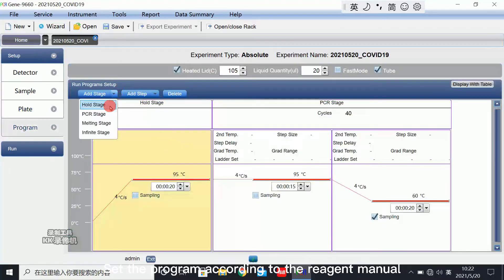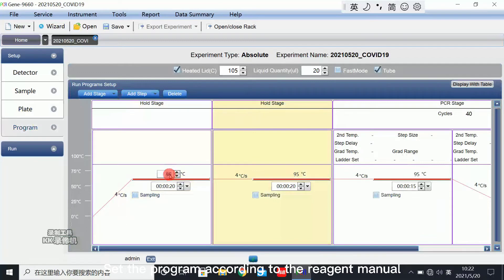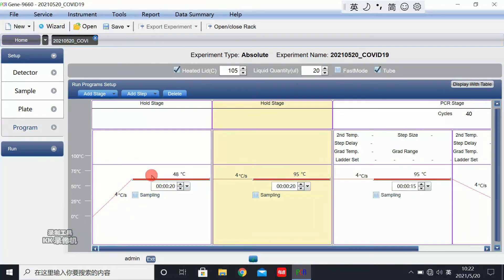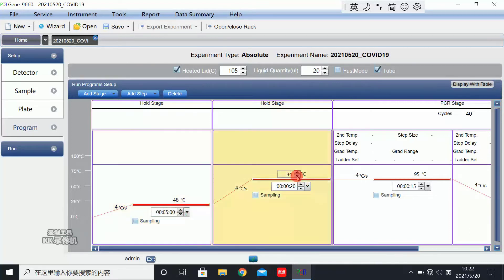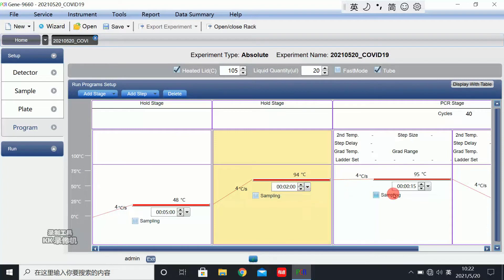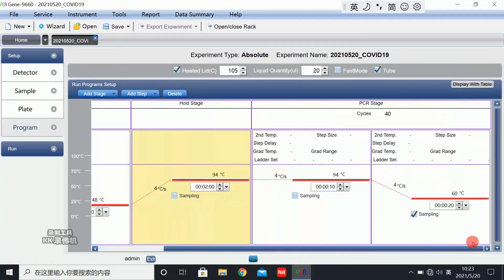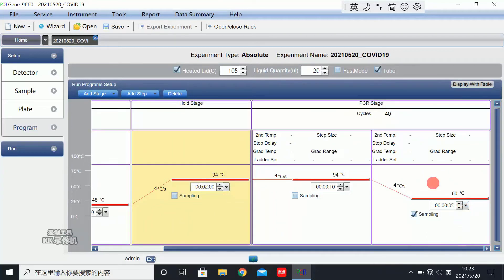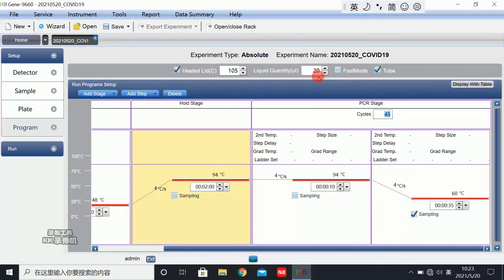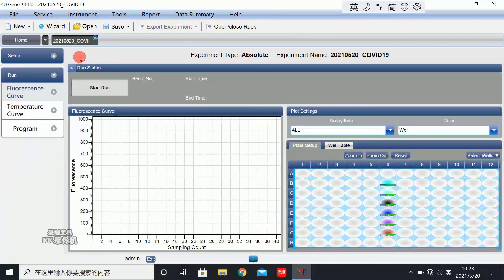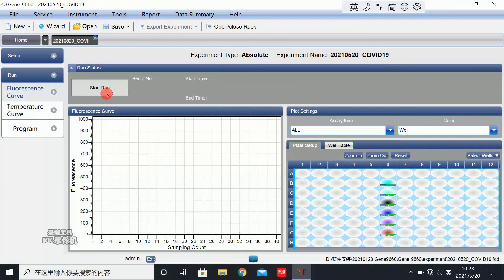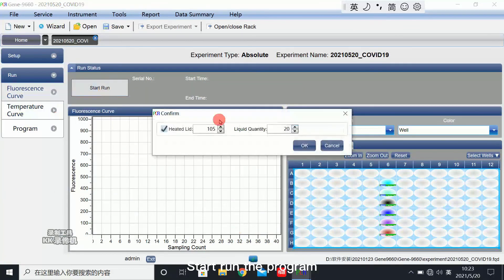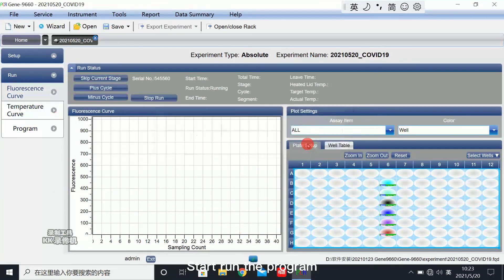Set the program according to the reagent manual. Save the program and start run the program.